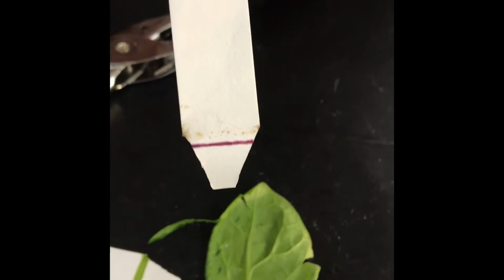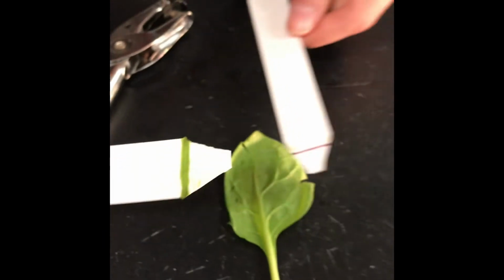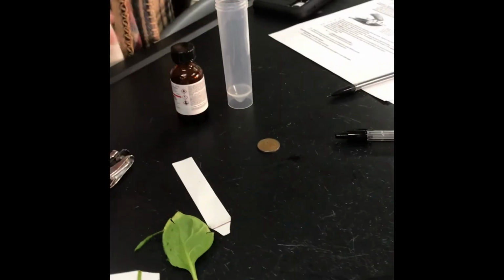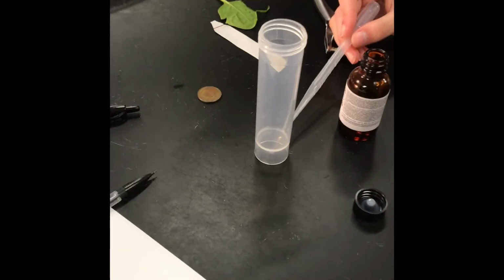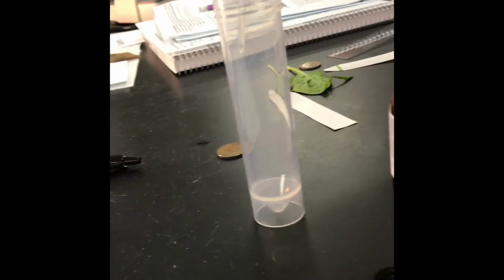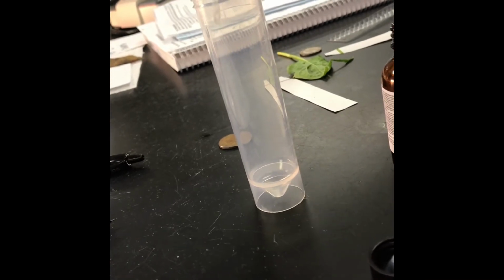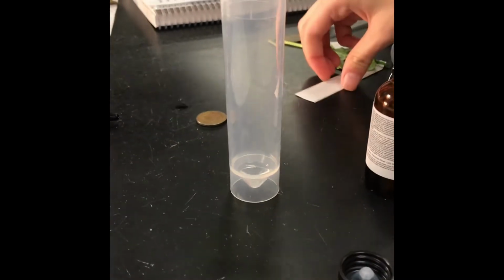Look at that. That's a fall leaf. And then this beautiful, look at this spinach leaf. So down at the tip, they used a coin and they rubbed the leaves to create that pigment line. All right, go ahead, yeah. Where is the pipette? So the pipette, let's see where the pipette is. Fill it up like to this line. Okay, so we're gonna add, you can see, perfect, using the pipette with chromatography solvent. Add a little bit to the tip. Okay, perfect. Because we want the pigment line to be above the chromatography solvent.